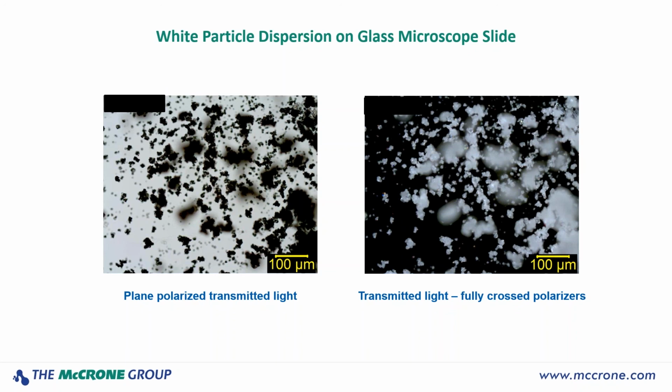As if the refractive indices in various orientations were more spread out, more different, the colors would start to go into yellows and reds and blues and so forth. But this is an indicator of a fairly low birefringence material, but it's really not the true color of the material.